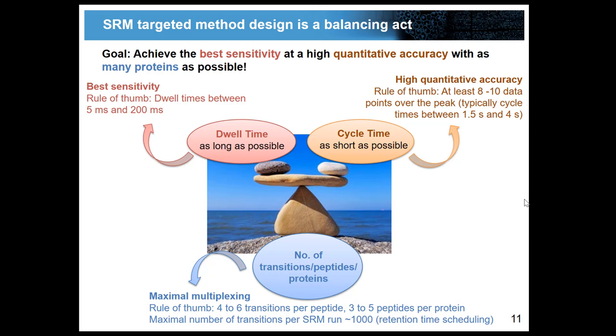Is it a scheduled MRM? Scheduled MRM, yeah. How does it work? Basically, you select a window, and you have to know what retention time the peptide of interest will elute. Then, based on the number of transitions you have in the list, you will decide what the window has to be. The advantage is the instrument is going to only trigger on that retention time plus or minus 10, 15 seconds for that particular peptide.